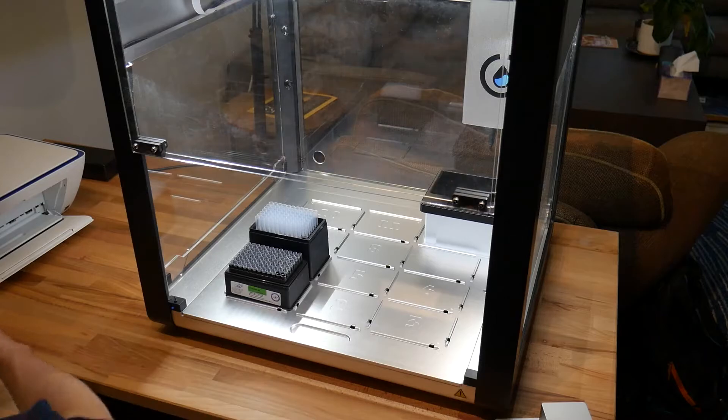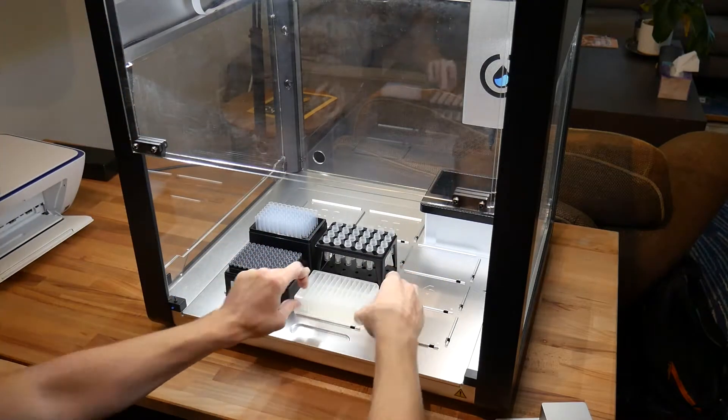One of the great things about the OT-2 is its flexibility. In addition to using any labware that you want, we have a range of pipettes that covers from 1 to 1,000 microliters for convenient laboratory transfers.